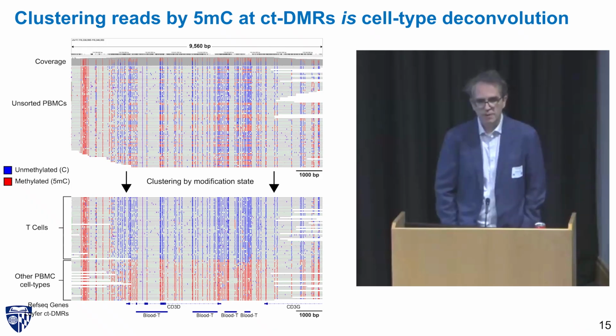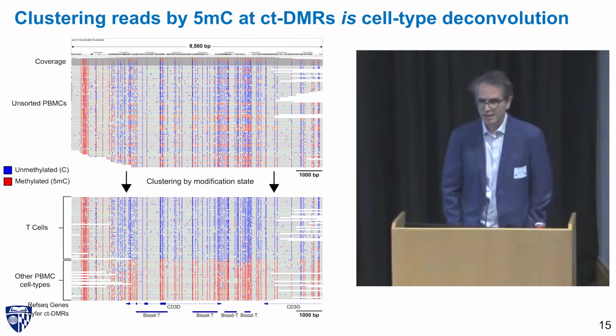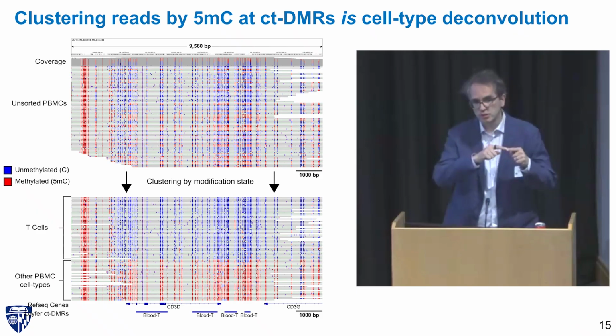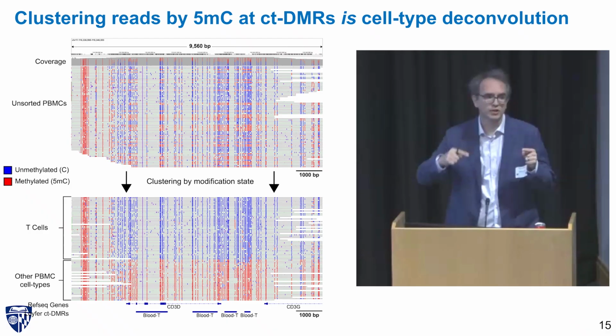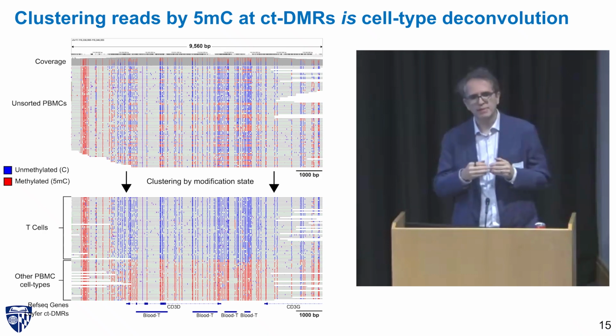I will tell you that from looking at bisulfite data and other data, and looking at methylation data for 15, 20 years now, there is biological truth to the fact that you do have some regions of the human genome or mouse genome or mammalian genome where you have a lot of variability in methylation. This is also termed by some methylation entropy. There have been a bunch of folks, like Amos Tanay, who has looked at this with epi-alleles, as has Chris Mason, and tried to say, what can we see from this? It turns out that you can even track clonality.